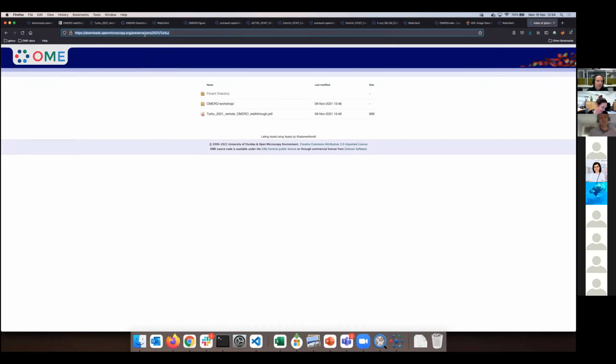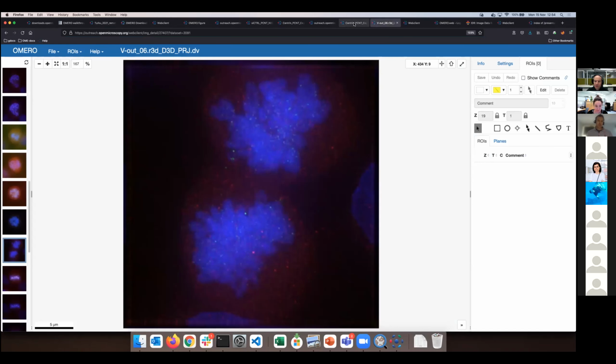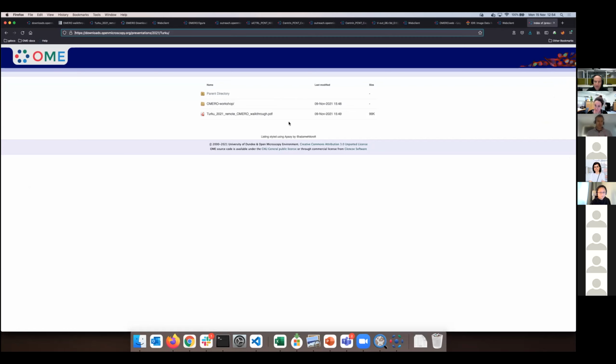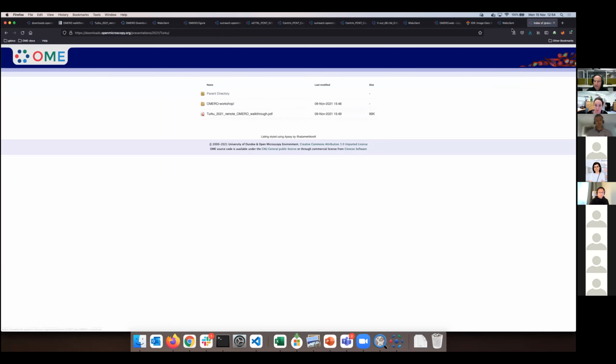The other way you can go about that, Joanna, is, so let me show you as many ways as possible, because it's always very hard to find a lifeline. If you find actually inside there, I hope that you have your hand on this. You somehow found this, yeah? The link is also here. So you can go from there to here. So it's like the database. Everything is linked together, and you will not lose your way around.